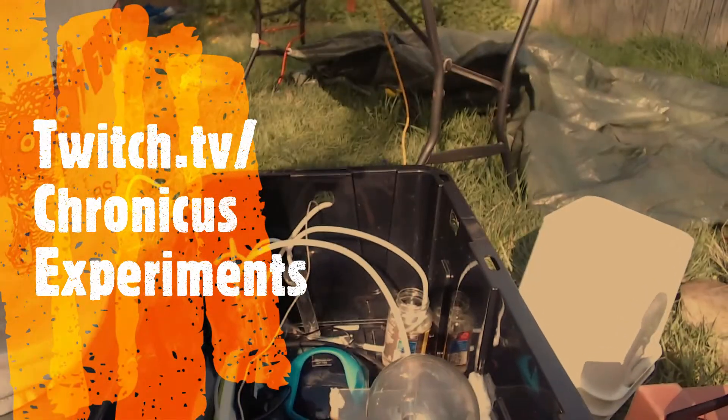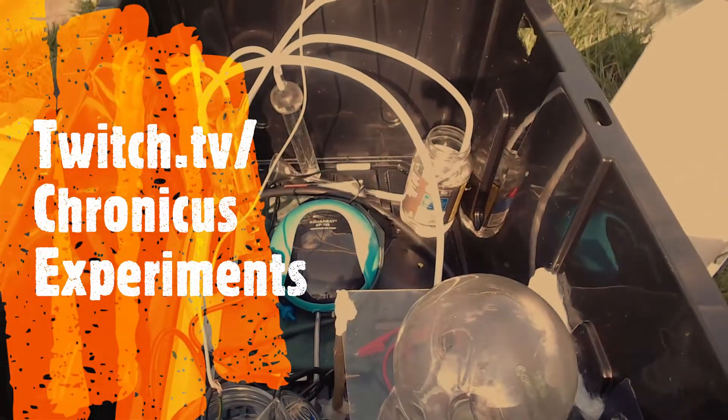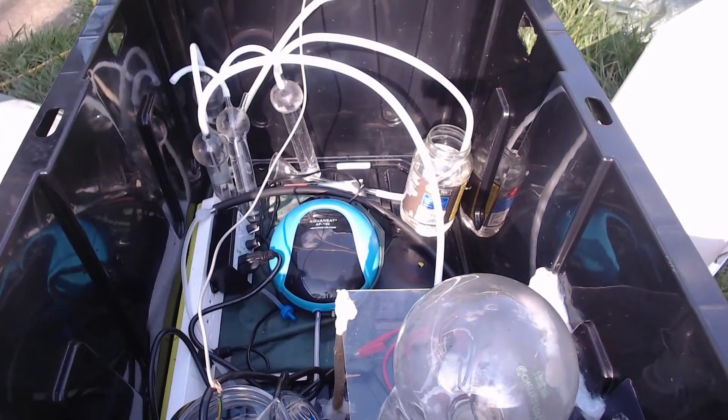Going to take apart the Birkeland-Eyde reactor, do a little bit of work on it, put it back together again, and see how that all works out.